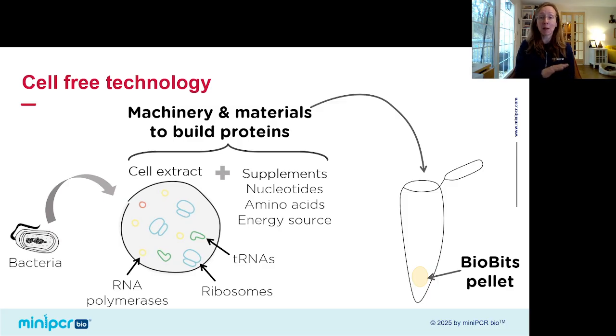BioBits was developed by my colleague on our curriculum team, Dr. Ali Huang. She was a PhD student at MIT and she was studying cell-free technology. And she became interested in the idea of making that science, which is amazing, cutting edge, used in science labs. She wanted to expand access to that technology to students to aid in biology learning. So she was really responsible for developing the Central Dogma Lab.